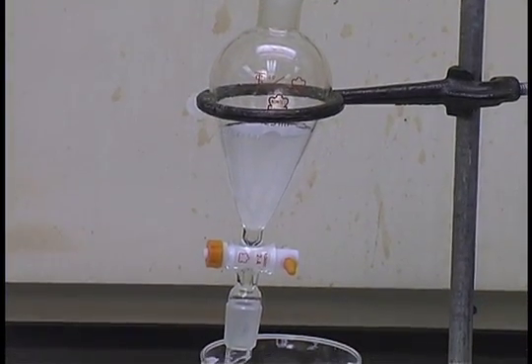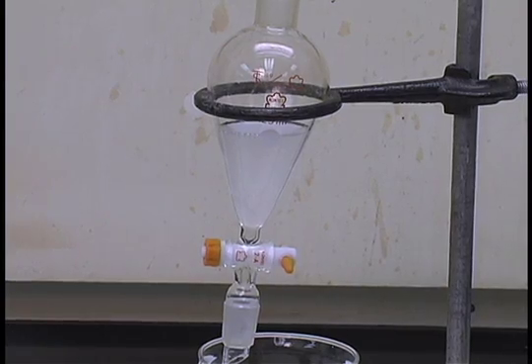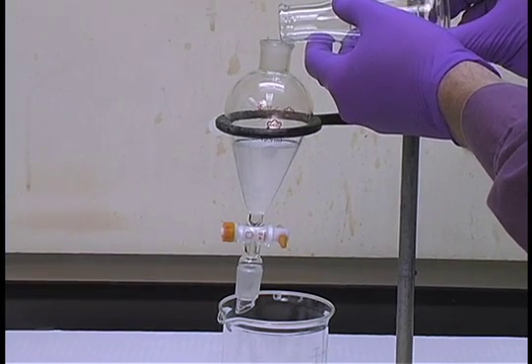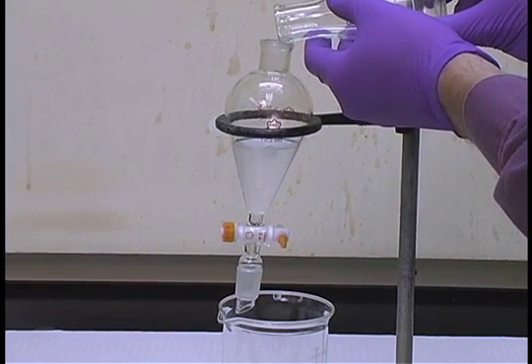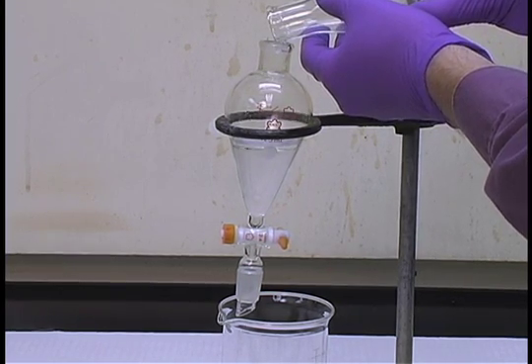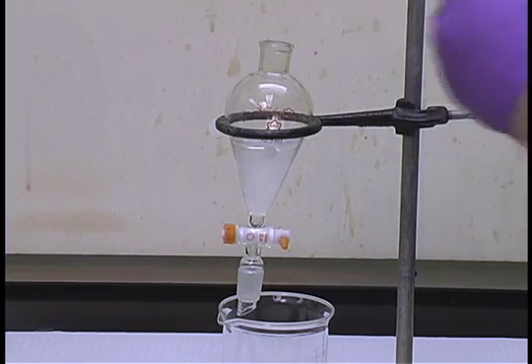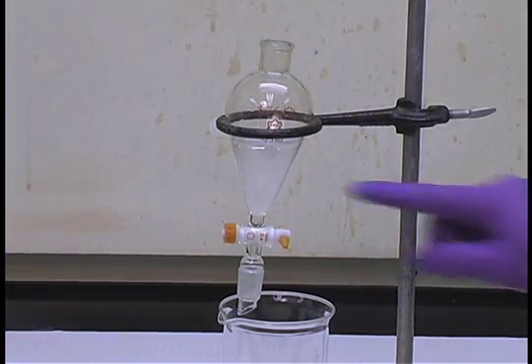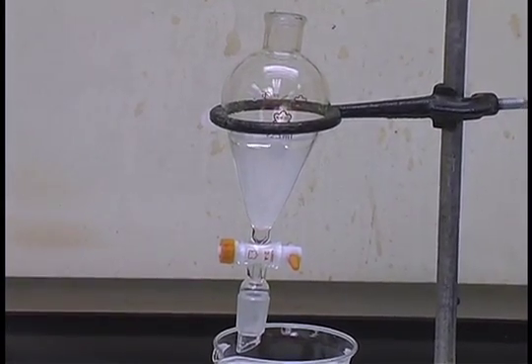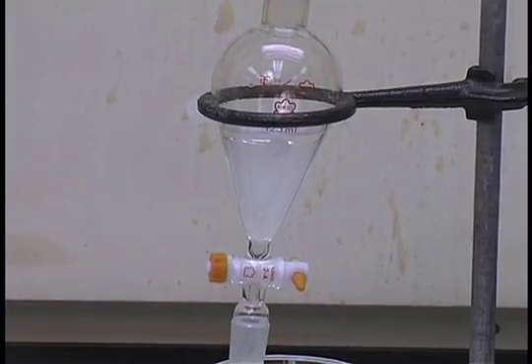At this point, you add the solvent that you're using to extract the original solution, and typically use about two-thirds the volume of the solution that you're extracting. The less dense solution will float upon the more dense solution, and you will be able to see a sharp boundary between the two liquids, even though they both may be colorless and clear.